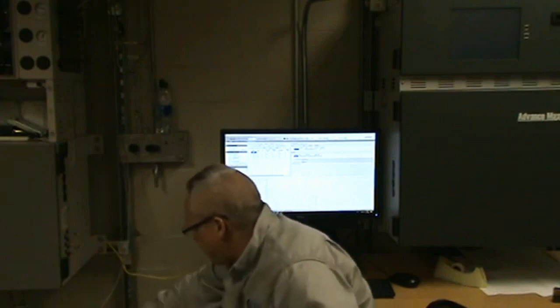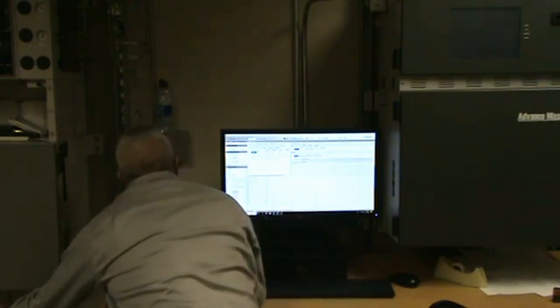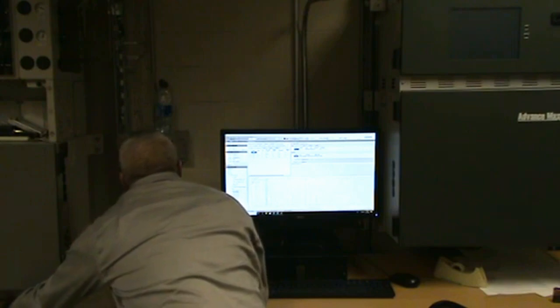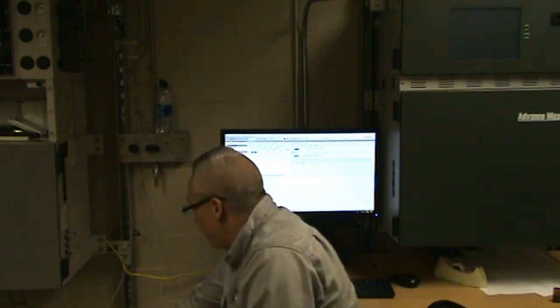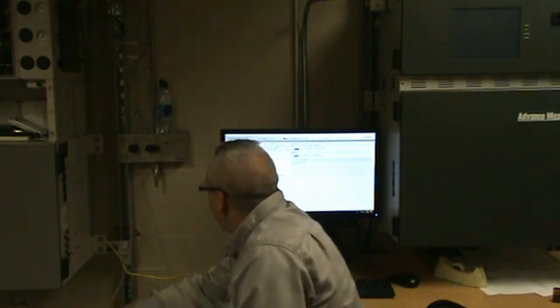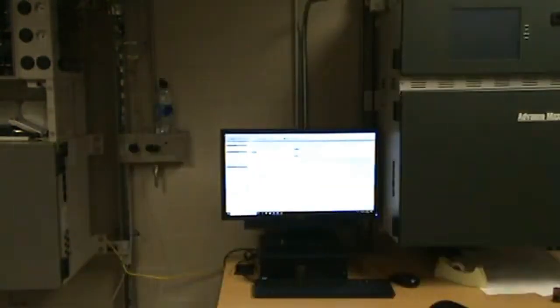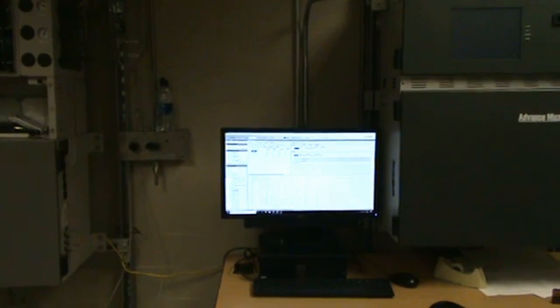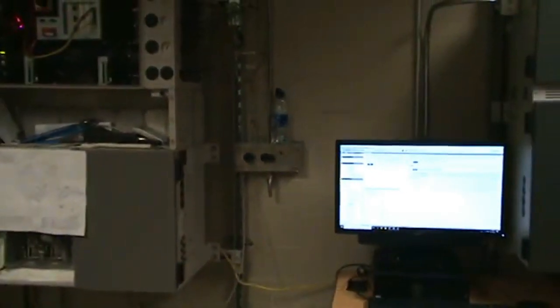Bottle on, and then we need to kick our regulator up. So I'm going to open the needle valve, and then I'm going to turn my regulator up a little until I see the needle barely come up. Okay, and now I got bubbles. Bubbles telling me I have good sample coming in, going through my valves, going through their sample loops.